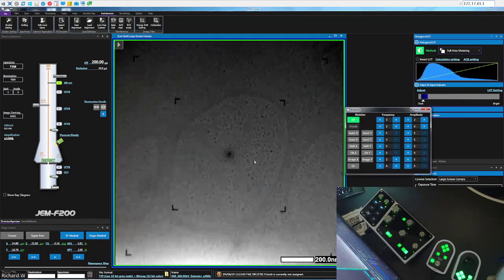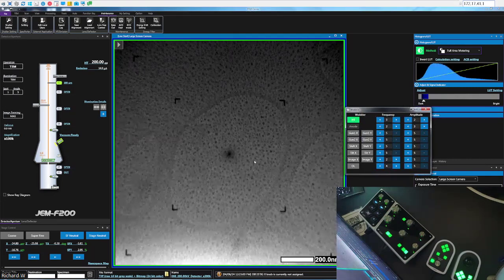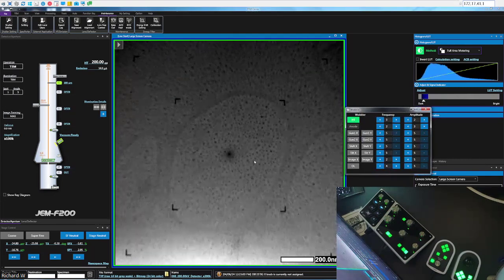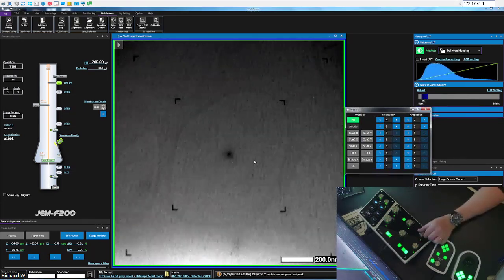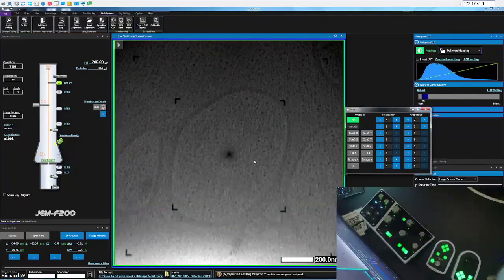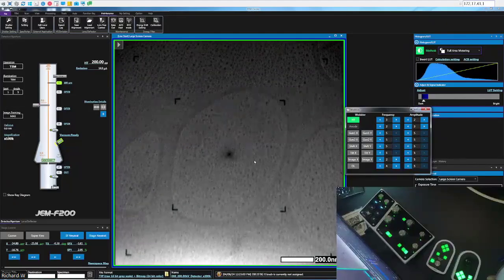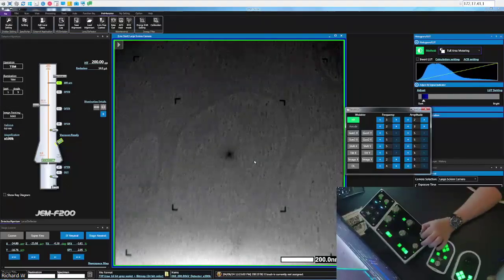So this now means that our beam is virtually parallel-sided, and all of our waves are plane waves. And so the wobbler, if there is any beam tilt, if I introduce it, you will see that with that beam tilt introduced, the image is not only expanding and contracting, but also shifting up and down. And so that's the effect of beam tilt. And we want to untilt the beam.